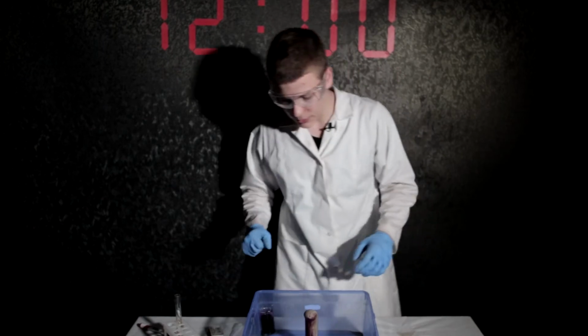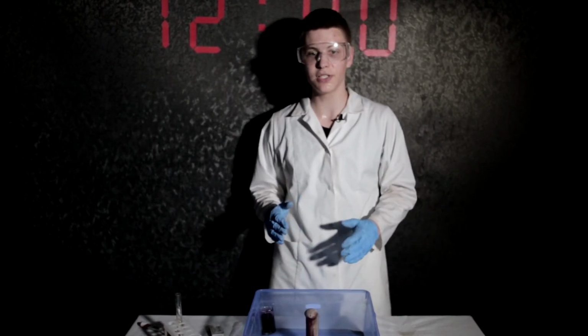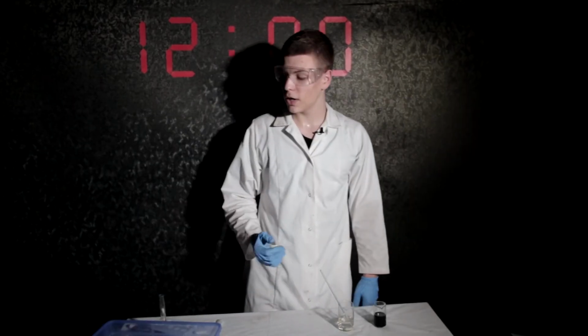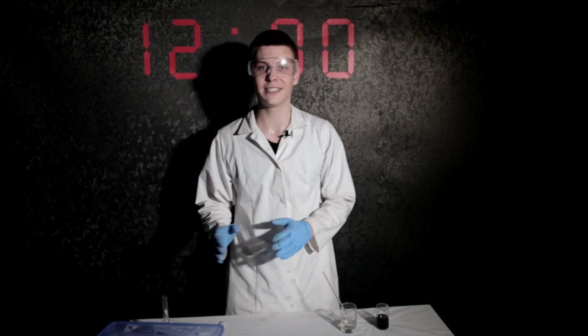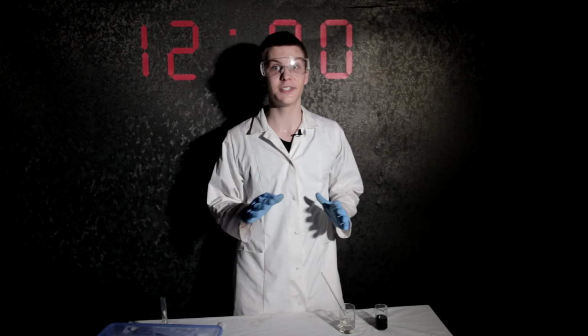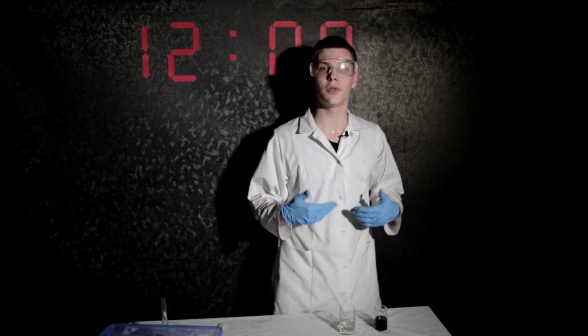Next we will proceed to understand the oxidation properties of hydrogen peroxide. I would honestly like to tell you that this one was one of my first experiments ever made. It was something like 4 years ago. Yeah, it was my first, but proceeding to the next one.